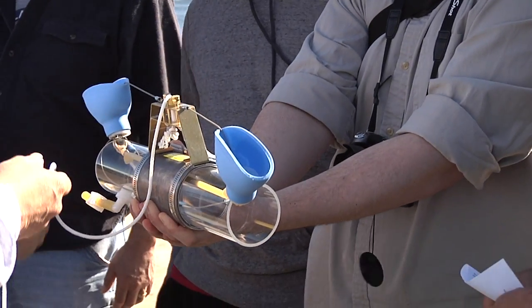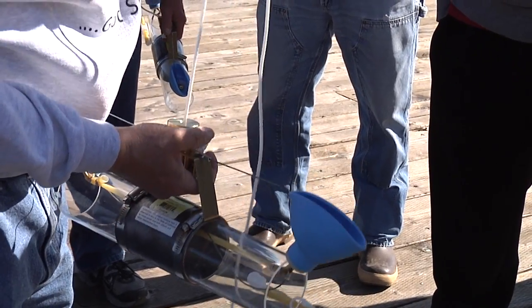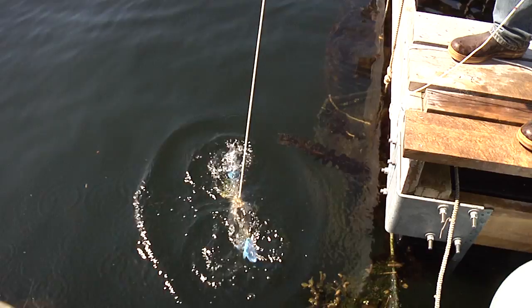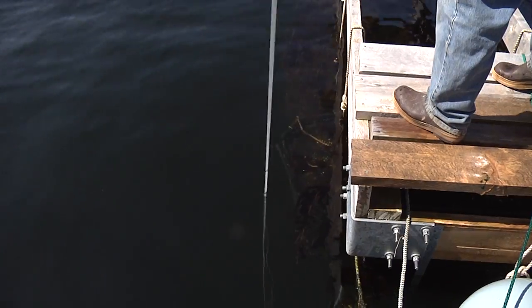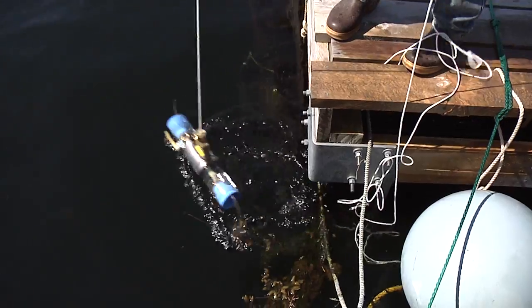This is about a $110 unit, so it's not terribly expensive. But this is what happens — you can lower it down in the water and you'll see that it closes off.